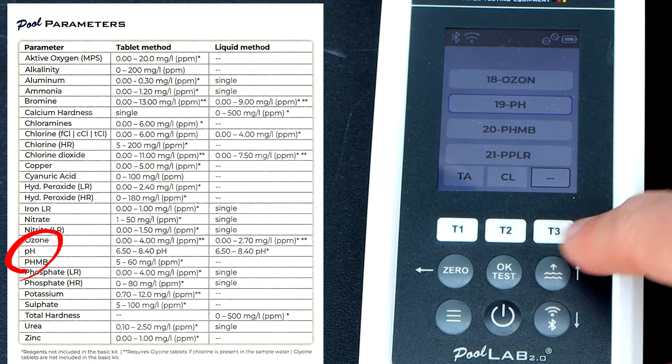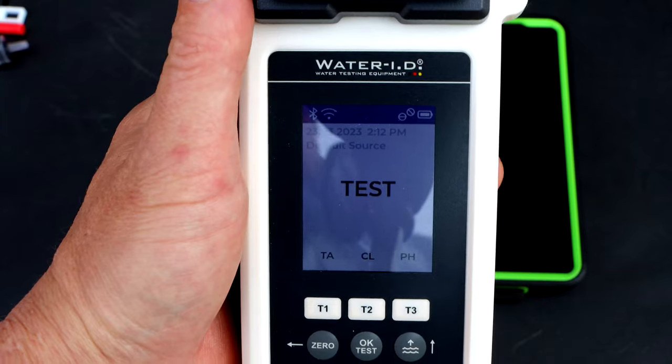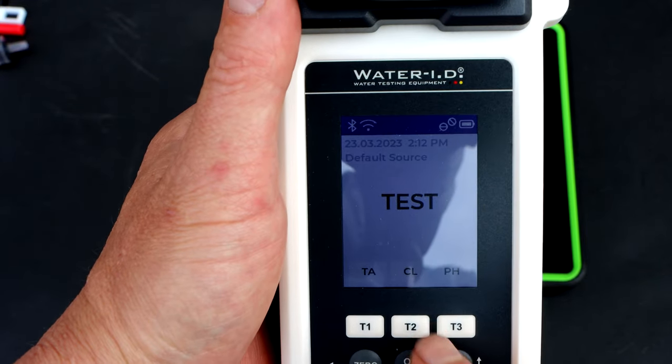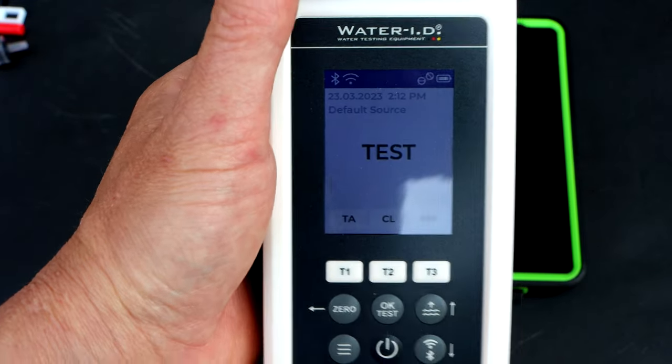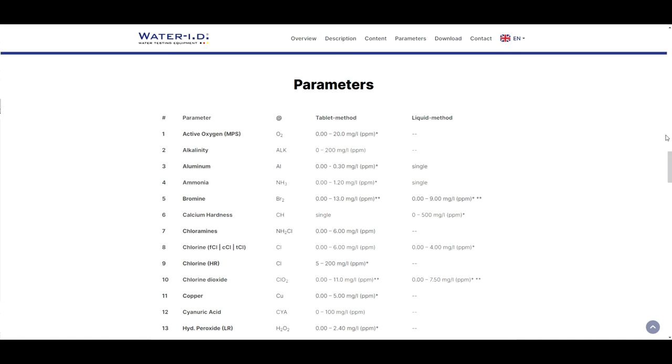You can see there's a lot of test factors in here. I have total alkalinity, chlorine, and pH indicated at the bottom. There are some test parameters that I think you definitely would want to order the tablets for. You have high chlorine which will test chlorine up to 200 parts per million.